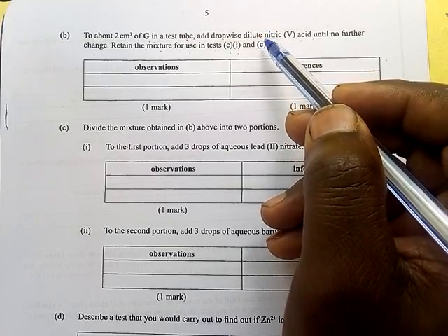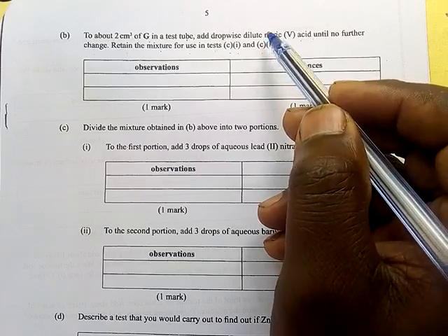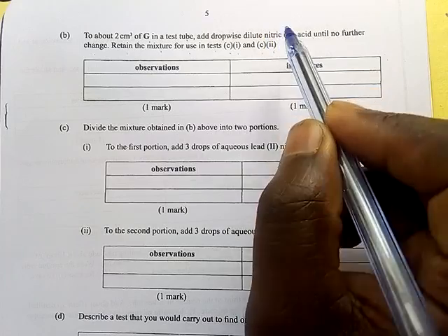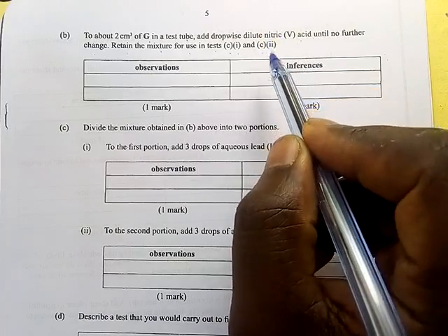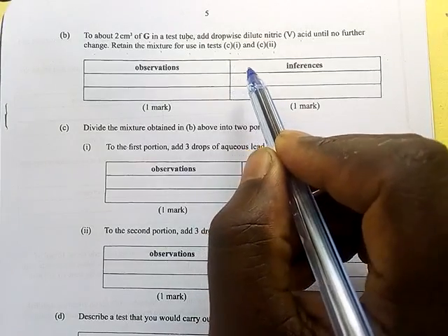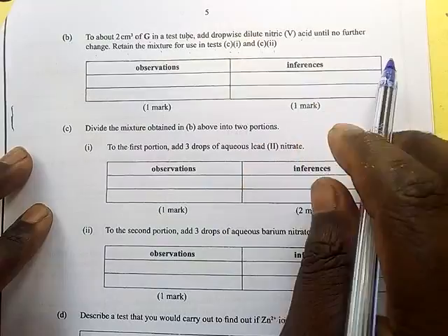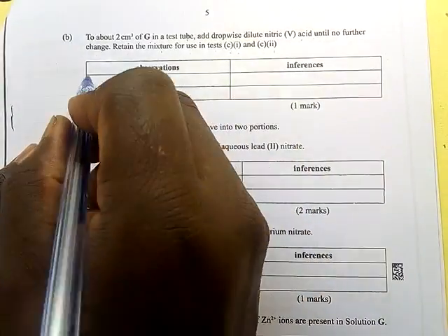So always remember that I am adding an acid to a solution or a solid in a test tube, then you must expect effervescence from the first word go. So here we expect effervescence.